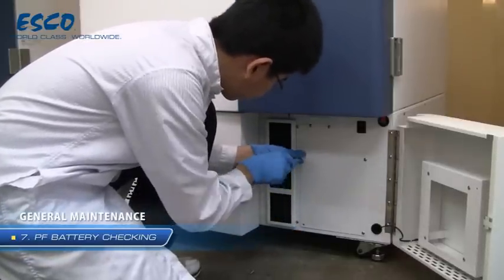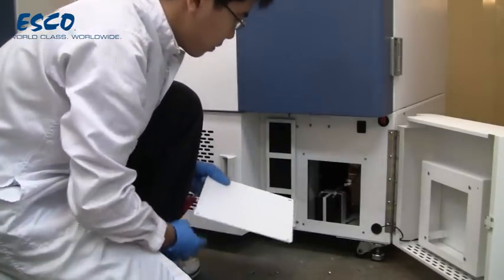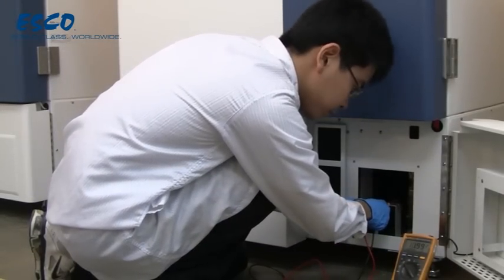Locate the battery and check its voltage output using a digital voltmeter. If the voltage goes below 12 volts, replace the battery.